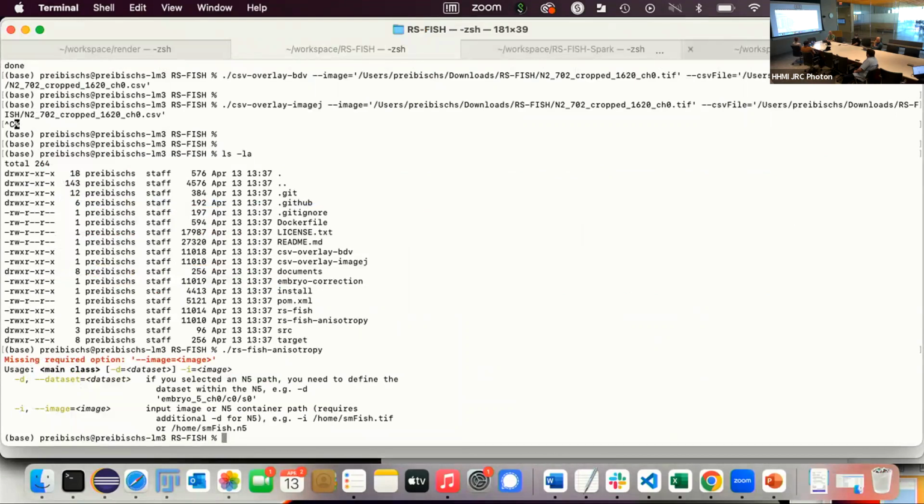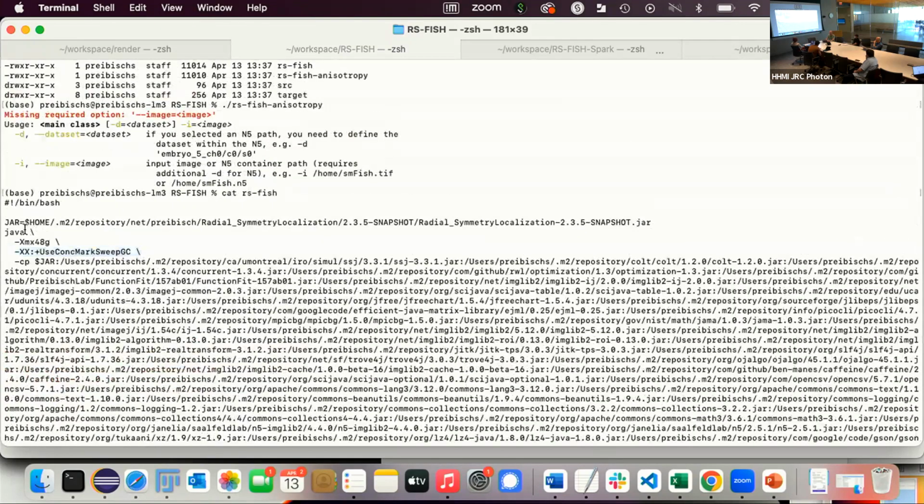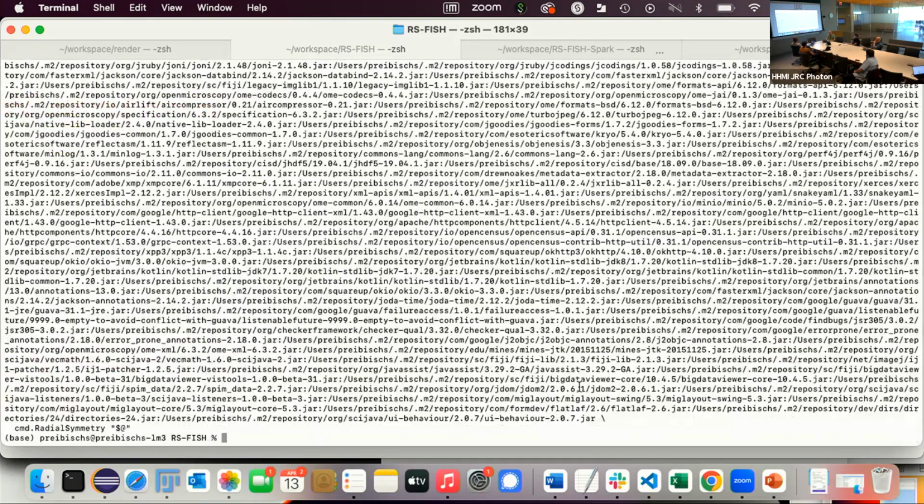Question first. How much does install actually do at this point? So it does the Maven build and creates scripts. It needs the Java virtual machine installed. Yeah, it needs Maven. Basically it creates this, sets the memory. There's some magic how to determine the system memory, and the rest is basically output from Maven. And it adds what the dependencies are.